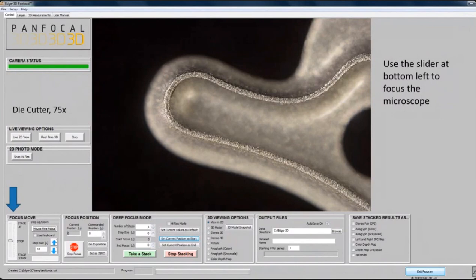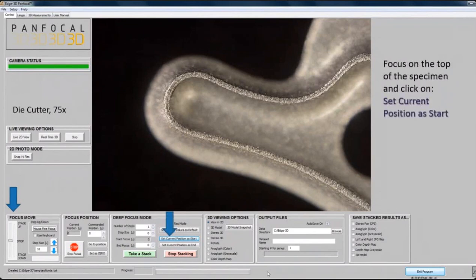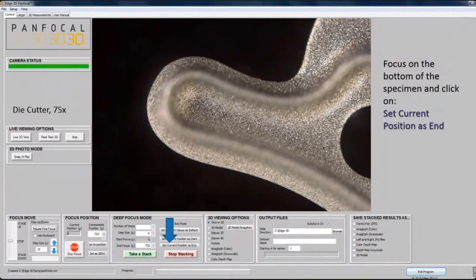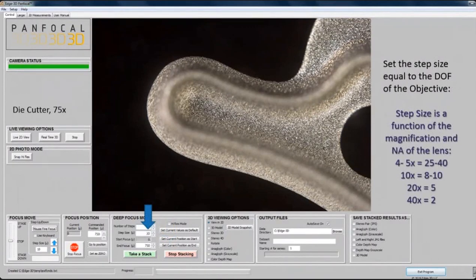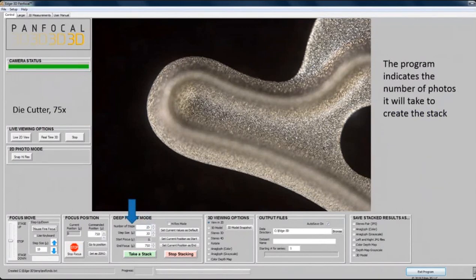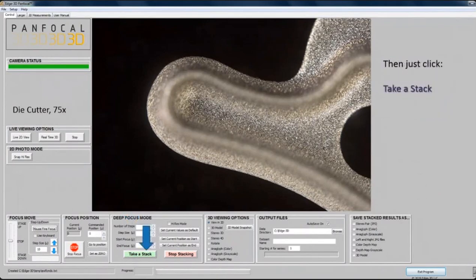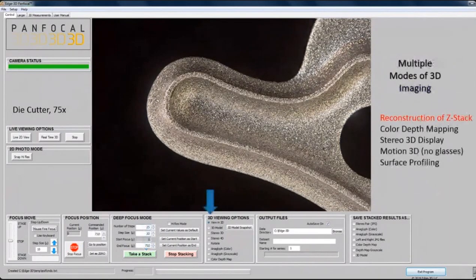Right now we're focused on the top of this specimen — a little tiny die cutter. You set the current position at the top, then focus down to the bottom. That was 750 microns. Then you tell the computer the step size — in this case 30 microns, which depends on the depth of field of the lens. We're using a 4x lens. You tell it the number of steps, click the button that says 'take a stack,' and in about 15 seconds the entire 750 microns is all in focus.